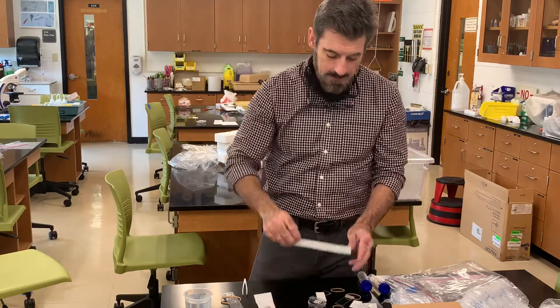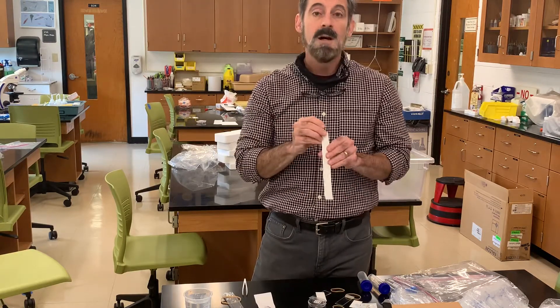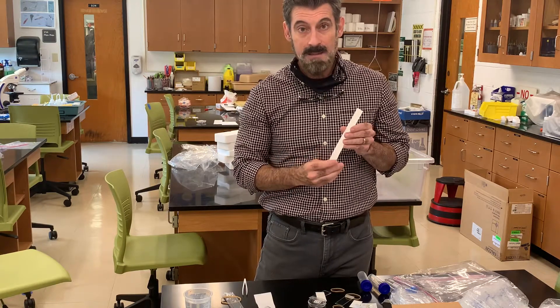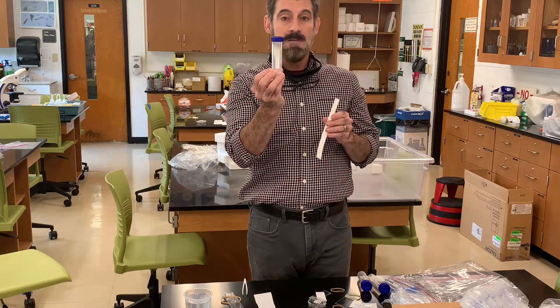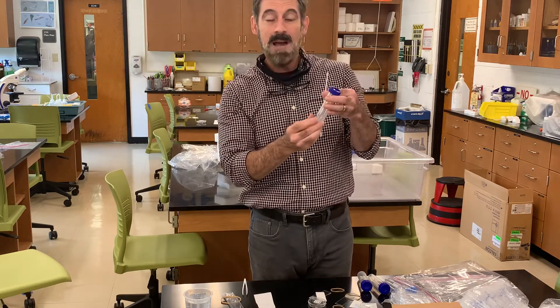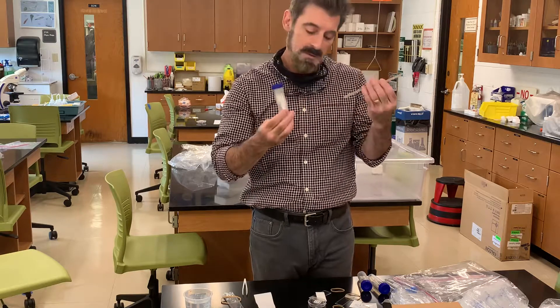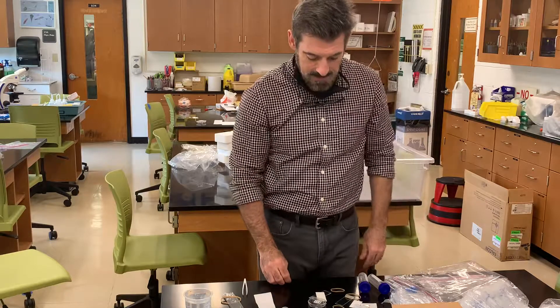You're going to have some paper that you can use for chromatography. We'll have a lab where you take any kind of plant material, apply it to the paper, and then use one of the containers as a chromatography chamber. You'll put a little bit of alcohol in the bottom, dip the paper in, and the alcohol will rise up and separate some of the pigments. You'll get to see something about plant pigments during that lab.